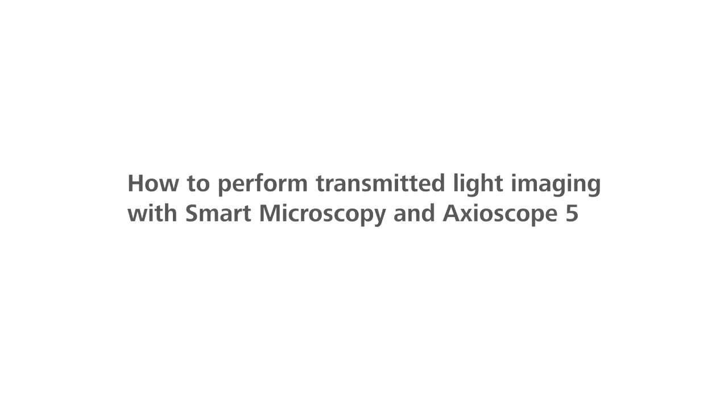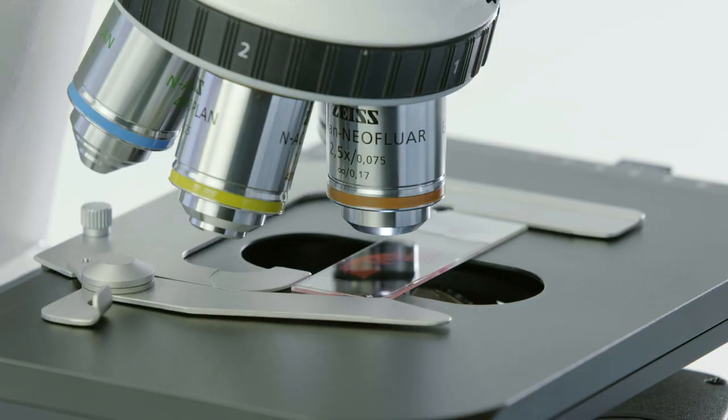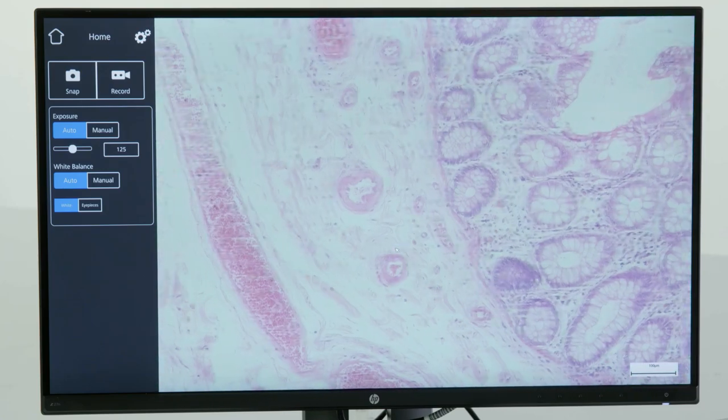How to perform transmitted light imaging with Smart Microscopy and Axioscope 5. Imagine acquiring images in transmitted light complete with the right scaling, using just your microscope, without a PC.